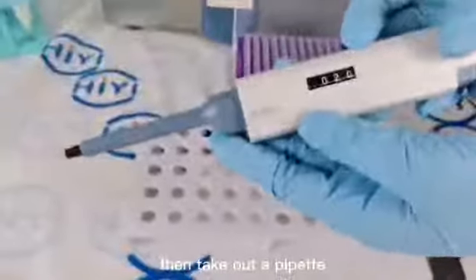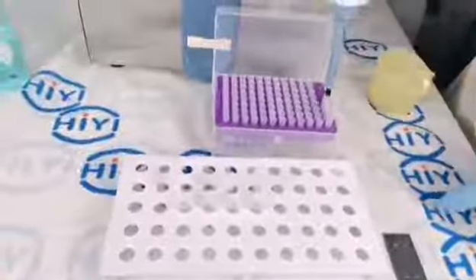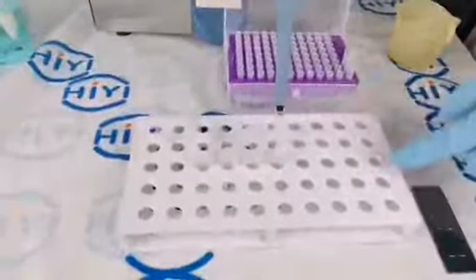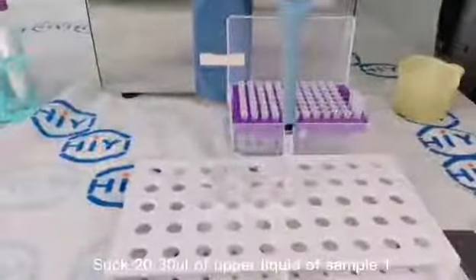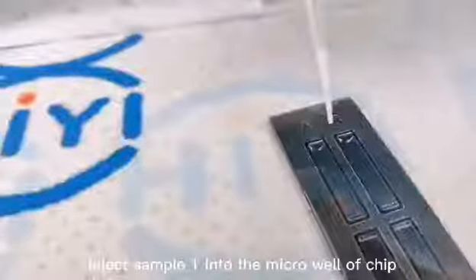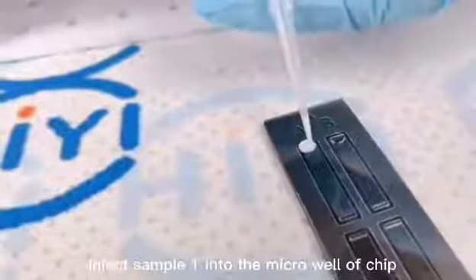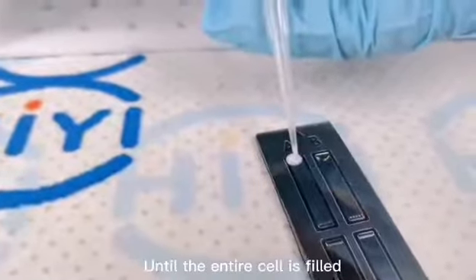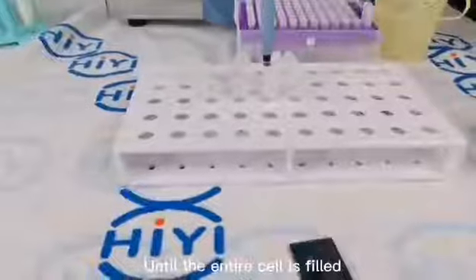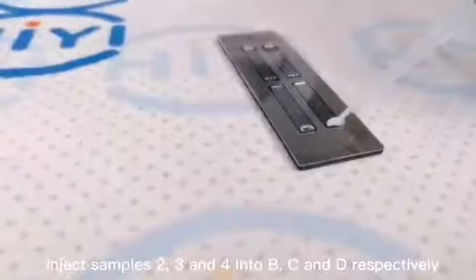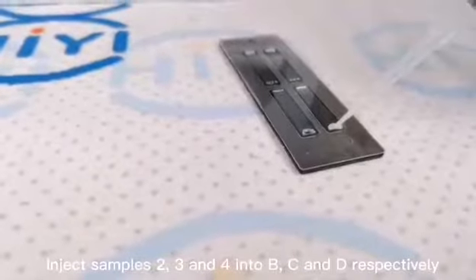Then take out the pipette. Insert the pipette tip. Suck 20 to 30 microliters of upper liquid of sample one. Inject sample one into the microwell of the chip until the entire cell is filled. Inject samples two, three, and four into B, C, and D respectively.